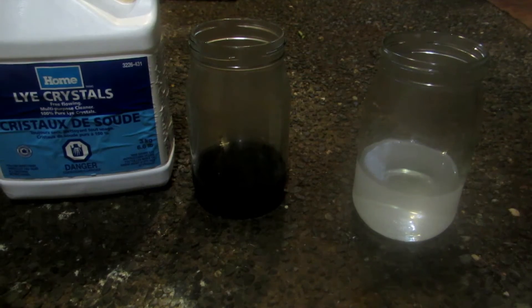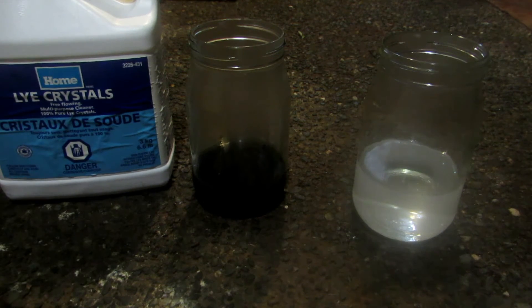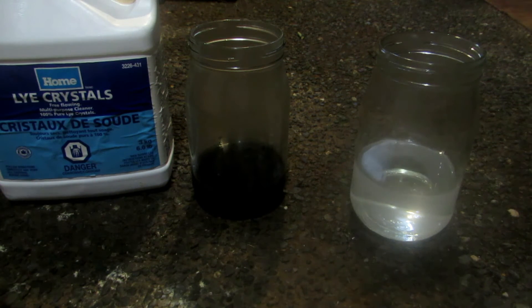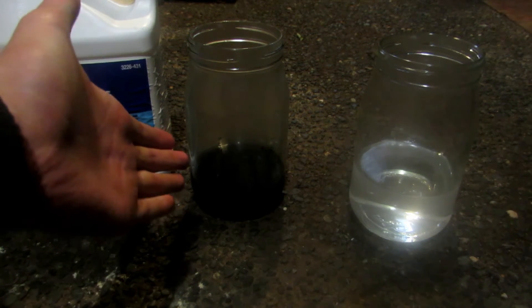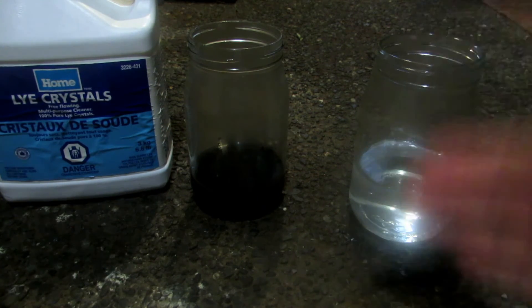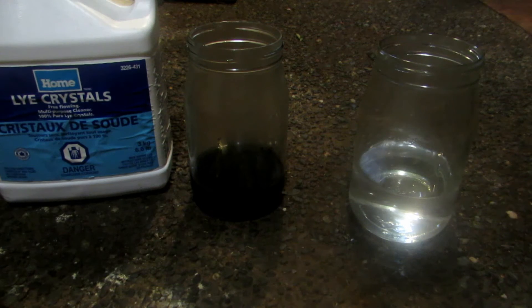This is the sodium hydroxide lye crystals from Home Hardware. Dissolve some into water — the concentration doesn't matter much, just keep adding until no more hydroxide precipitates out. The reaction we're doing is a displacement reaction: our lithium chloride and cobalt chloride react with sodium hydroxide to form sodium chloride, lithium hydroxide, and cobalt hydroxide. Cobalt hydroxide is insoluble and precipitates out, while lithium hydroxide stays in solution, separating the two compounds.